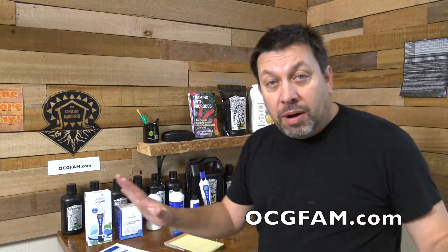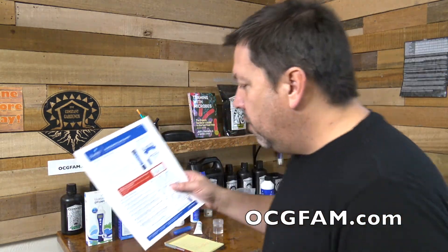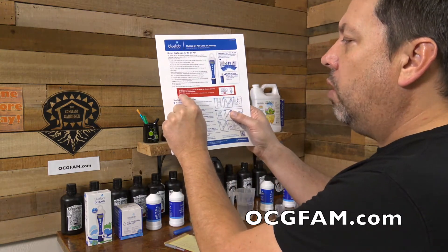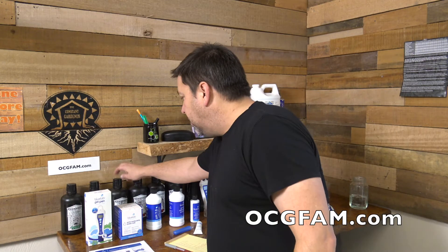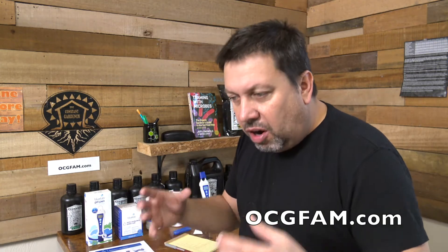Now we're going to calibrate. But first, I want to mention one thing — never store, rinse, or soak the pH pen in RO, reverse osmosis, distilled, or deionized water. Pure water changes the chemistry in the reference, causing the probe to die. A lot of people use RO water for their nutrient mix, and it won't even measure RO or distilled water unless you have a little bit of nutrients in there. So if you're checking your water's pH, put just a drop or two of nutrients to give it a charge to work with. But for rinsing, cleaning, or storing — none of those waters. Just tap water, then store it in the KCL solution.